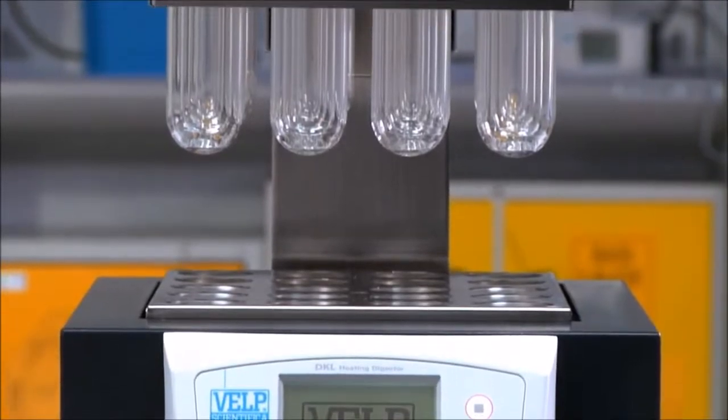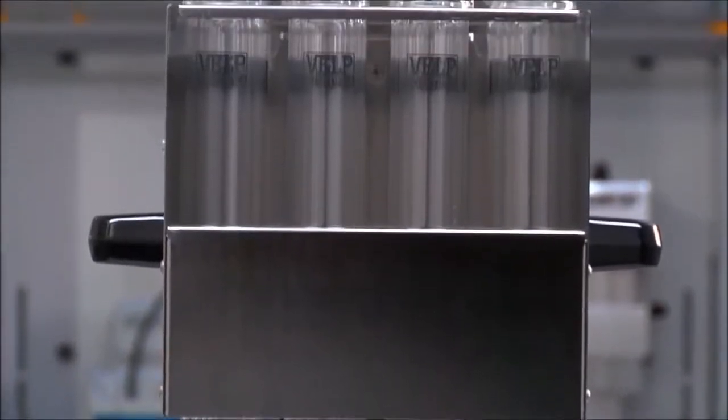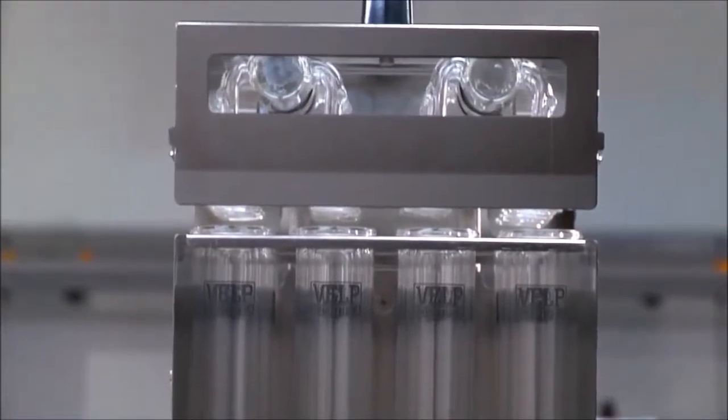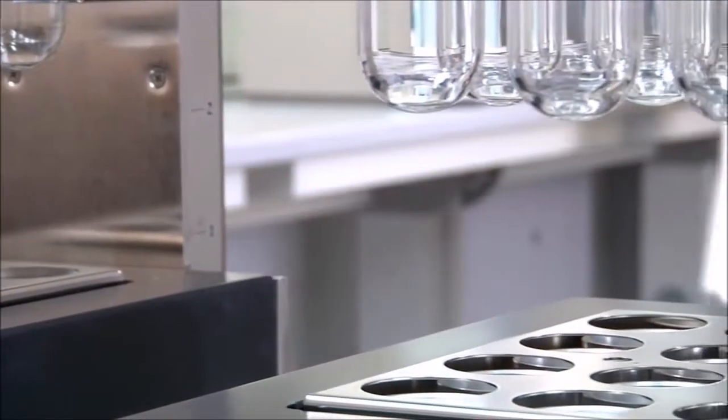DKL series, fully automatic Kjeldahl digestion units. The new automatic Kjeldahl digesters from Velp Scientifica provide users with the ultimate technology whose objective is to simplify operation, improving the safety.